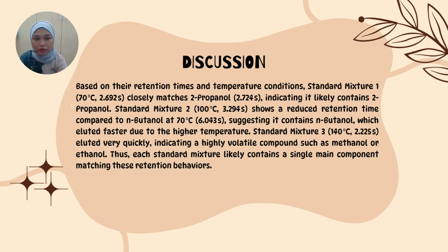Standard mixture 3 at 140 Celsius, 2.225 seconds, eluted very quickly, indicating a highly volatile compound such as methanol or ethanol. Thus, each standard mixture likely contains a single main component matching these retention behaviors.